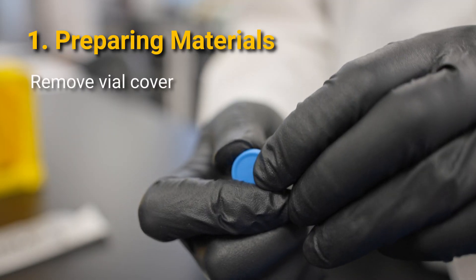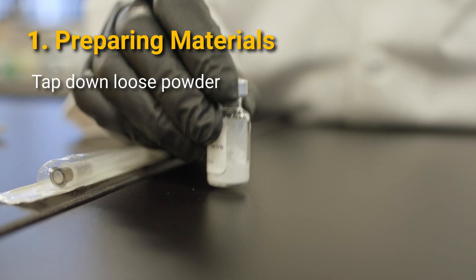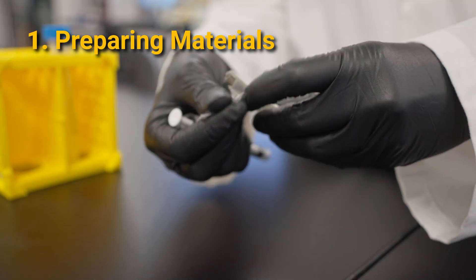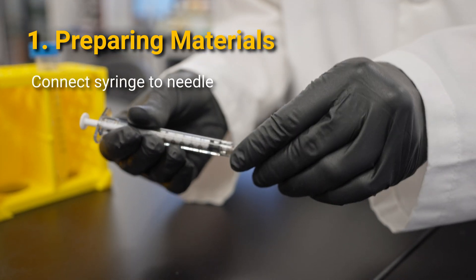First, remove the plastic cap from your vial and gently tap down any loose powder on the sides. Then connect your syringe to your needle.